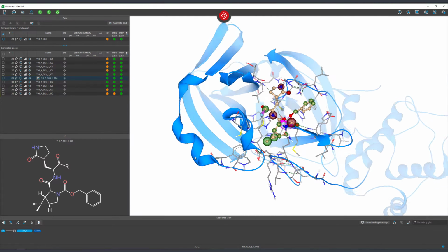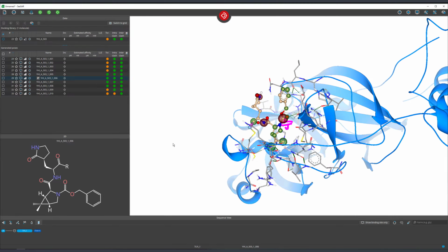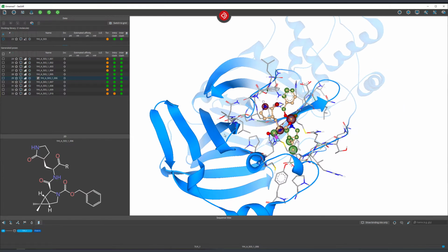You could find other residues for possible covalent targeting, or you could edit residues in the protein in the protein editor of SeeSAR and create new versions of your binding site for covalent docking. Or in the extreme case, if you had loaded a protein that did not have a residue compatible for covalent attachment, you could create this in the protein editor and then perform covalent docking.